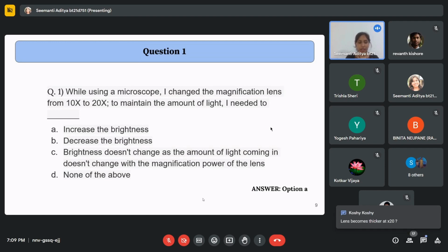Also there is another term that is called exposure. Exposure means how much time you have to expose the cells in order to get a good amount of fluorescence. Exposure time is used generally for fluorescent microscopes.